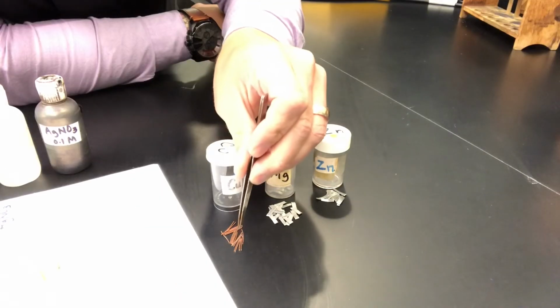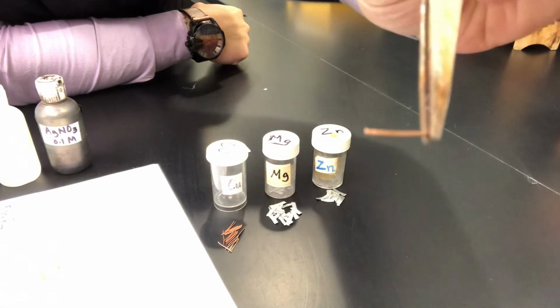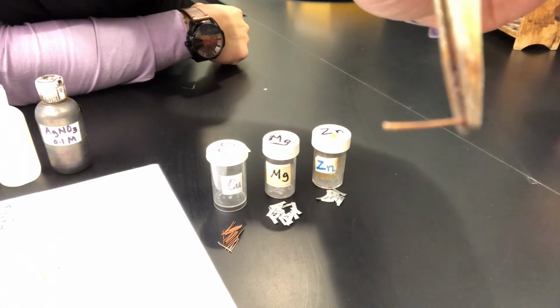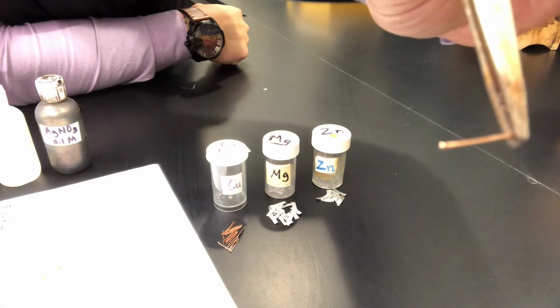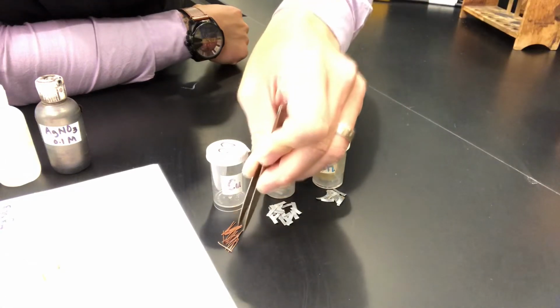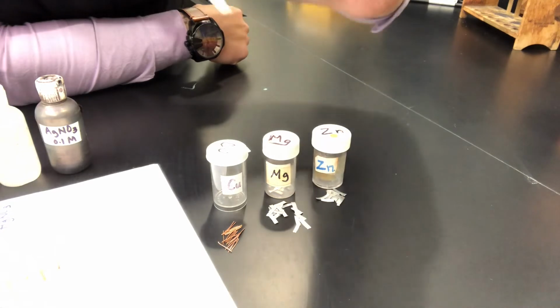So first we're starting with pure copper. If you look, pure copper, you've seen it before, like the coating on a penny. Take your observations, but that's an orangish brown, shiny metal. It is also malleable, right? So typical of metals. Magnesium and zinc look very similar.